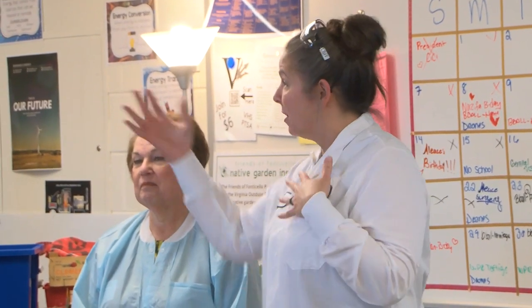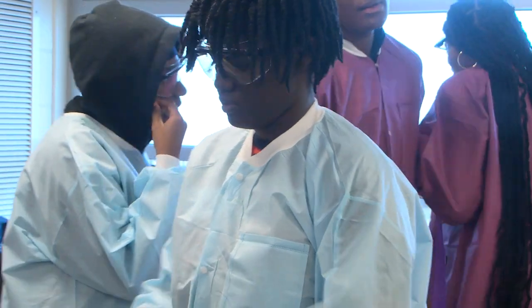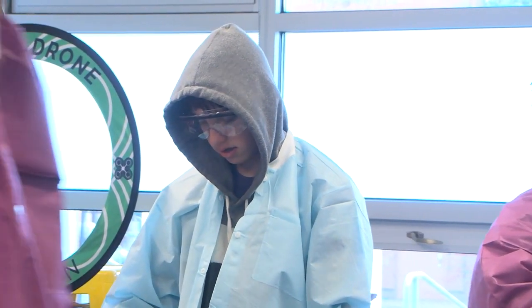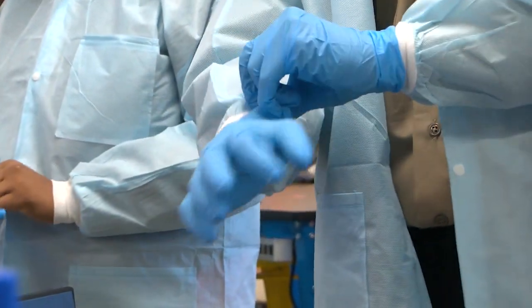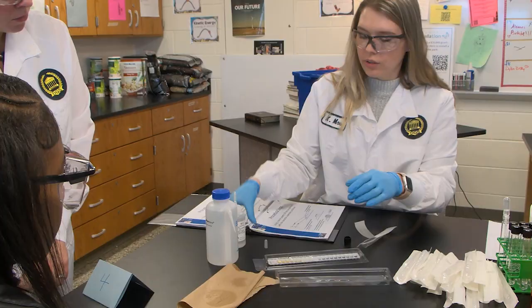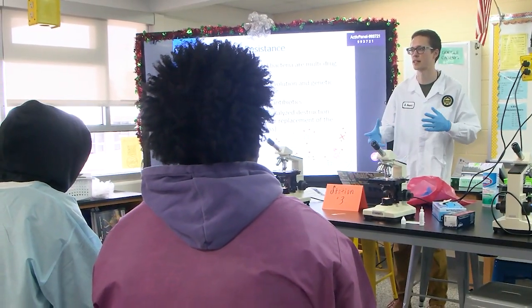Even though we are not working with hazardous materials, we all want to simulate that environment that you see all of us garbed up for appropriately, and that's going to include a water fluid resistant kind of gown or lab coat of some sort, eyewear protection, as well as gloves when you're working at the different stations. Just the entire presentation, how they arrived and had all of their personal protective equipment, I really think that it really put the students in a scientific mind frame.